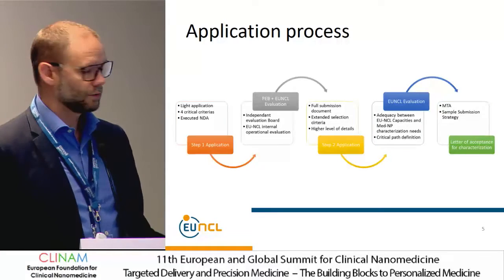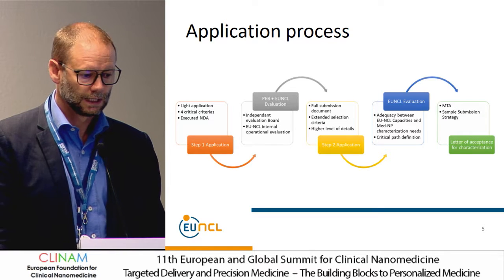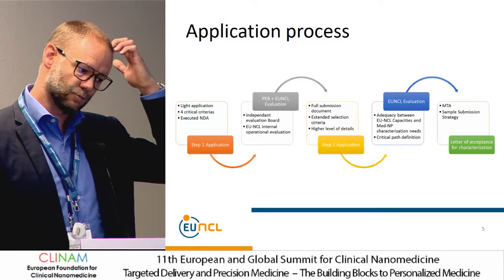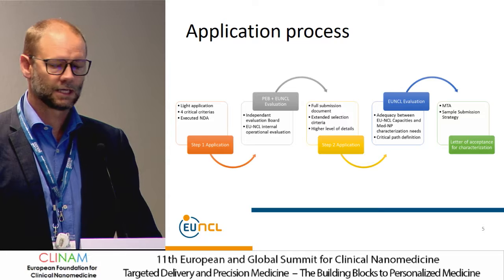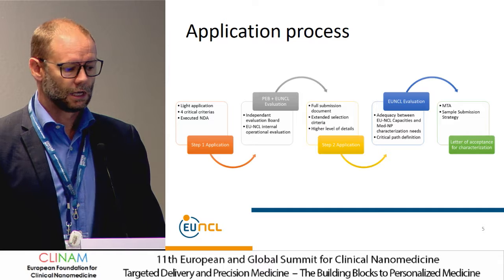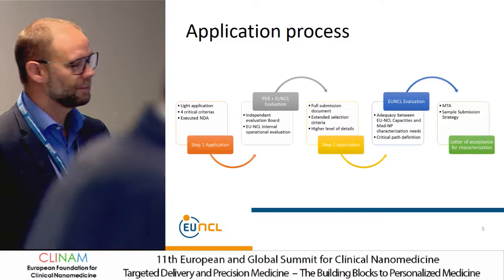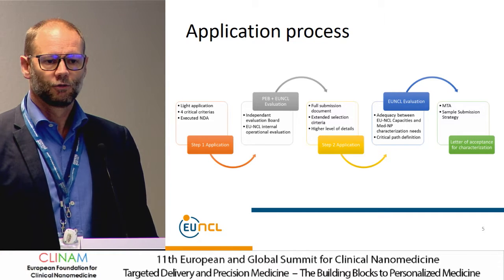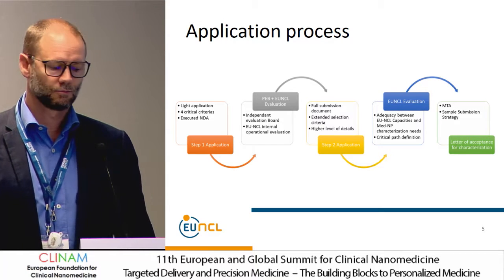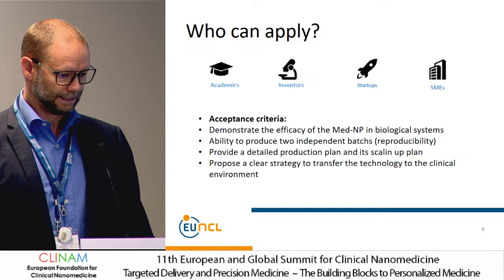After the step 2 application, step 2 is usually an interview where we are discussing a lot. After that, if everything goes well, we go for a characterization where we have some details to manage, like the material needed, the research plan, and the MTA, of course, because this is critical in the case of material exchange. That's the usual basis. Globally, the total application process takes 2 to 3 months, maybe 4, depending on the time we have to negotiate the MTA, which is usually the most difficult administrative and legal burden in this process.